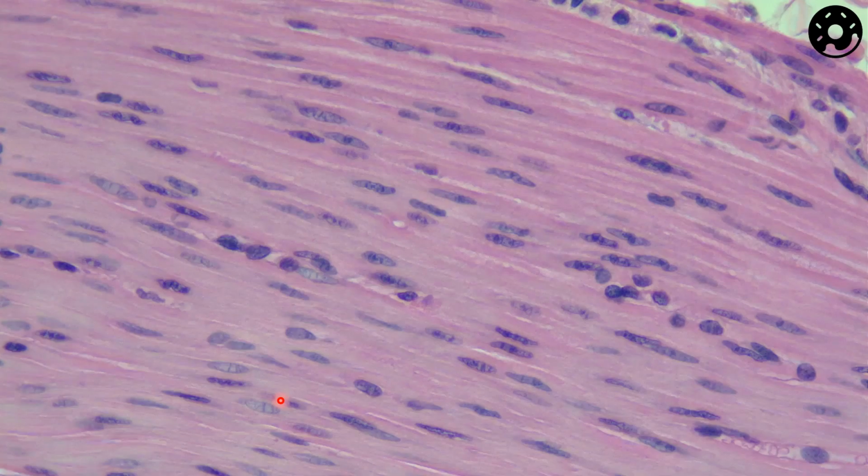And then we also have this image right here. This too is smooth muscle. Again, you don't have the striations, you don't have the lines, but you can see these large purple nuclei. And that's going to tell you that you're looking at smooth muscle and that you're not looking at any other type of muscle, and you're not looking at dense regular connective tissue.